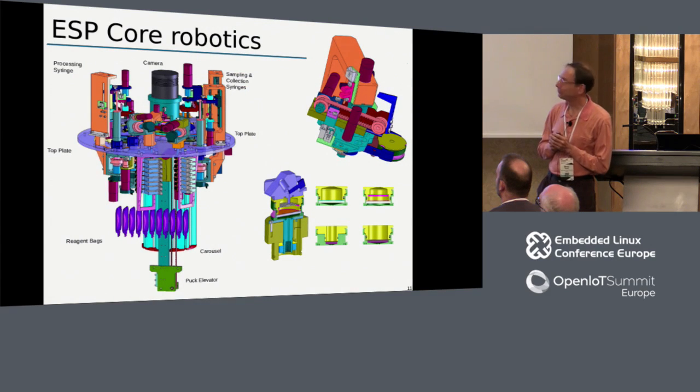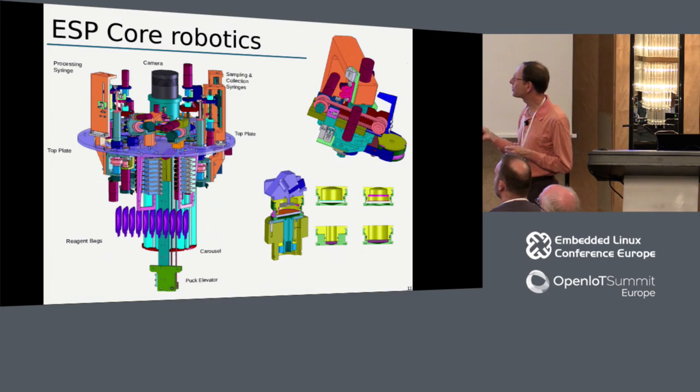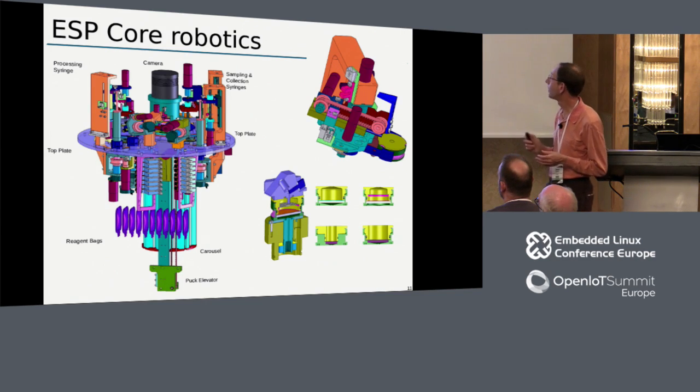Let's look at the robotics itself - the nuts and bolts of what makes this possible. The ESP consists of about 10 servo motors, small servo motors, and eight rotary valves, plus about 20 solenoid valves. Here you can see a solid model of the robotic arm that moves pucks from the storage carousel - where they're stored in stacks of about 132 - to the clamps where they're processed. We can draw water or other reagents through the filters there, then put the pucks back in the carousel once processed. This is a cutaway view of one of those clamps.